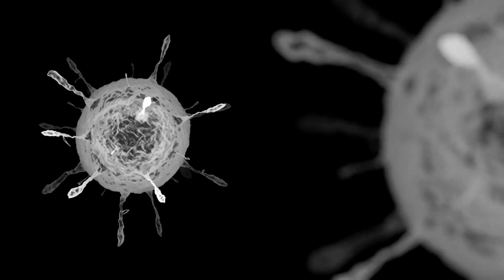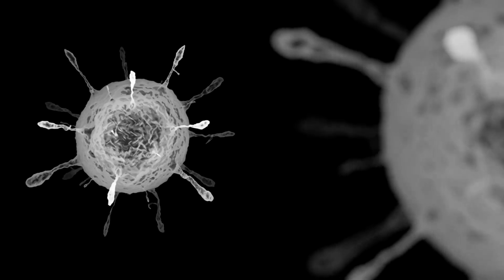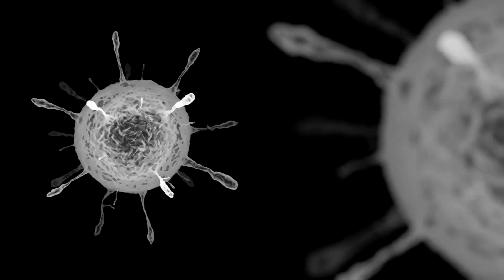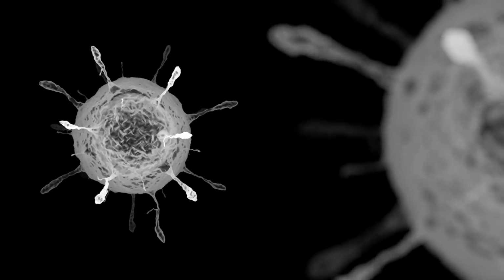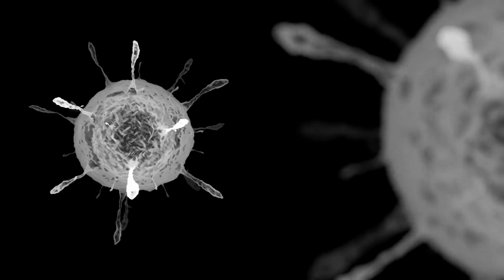a cell. One of the greatest things about light microscopy is that you can look at things that are alive. You can place living cells in a drop of water on a glass slide and watch them in real time. You can see them move, eat, and even divide into new cells. This is incredibly powerful for biology.